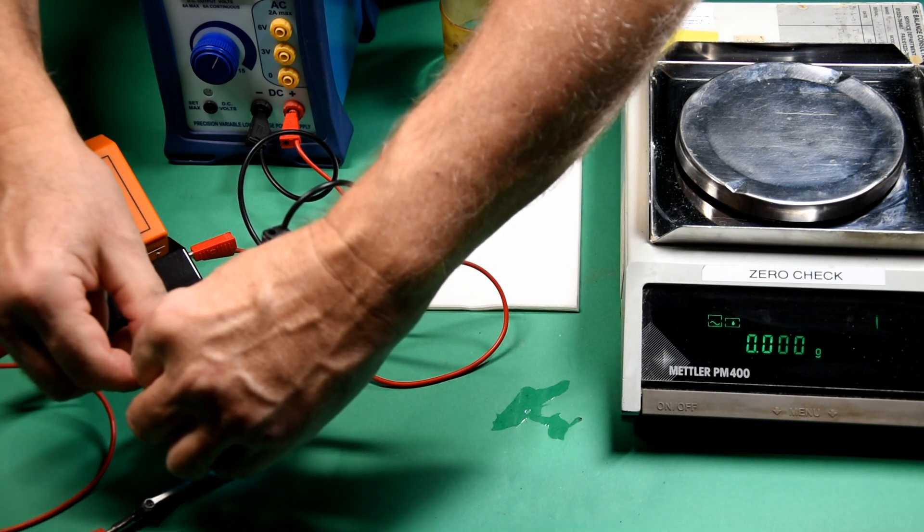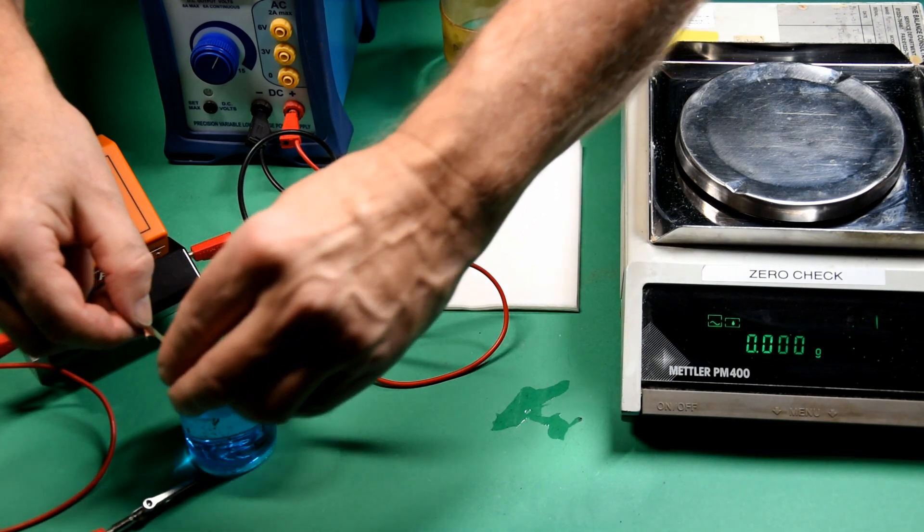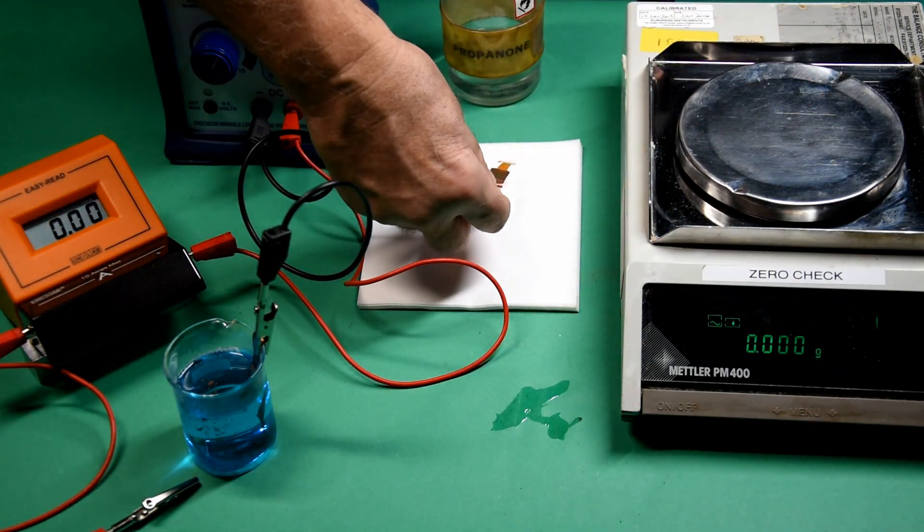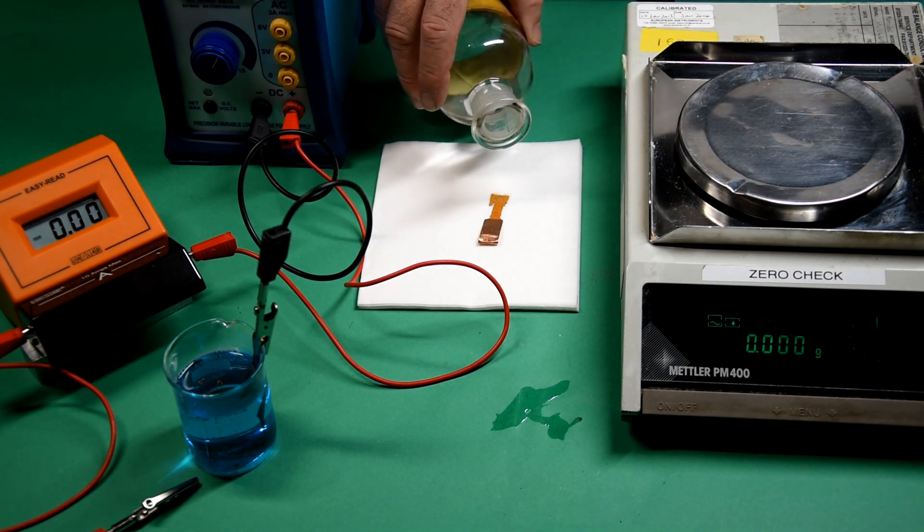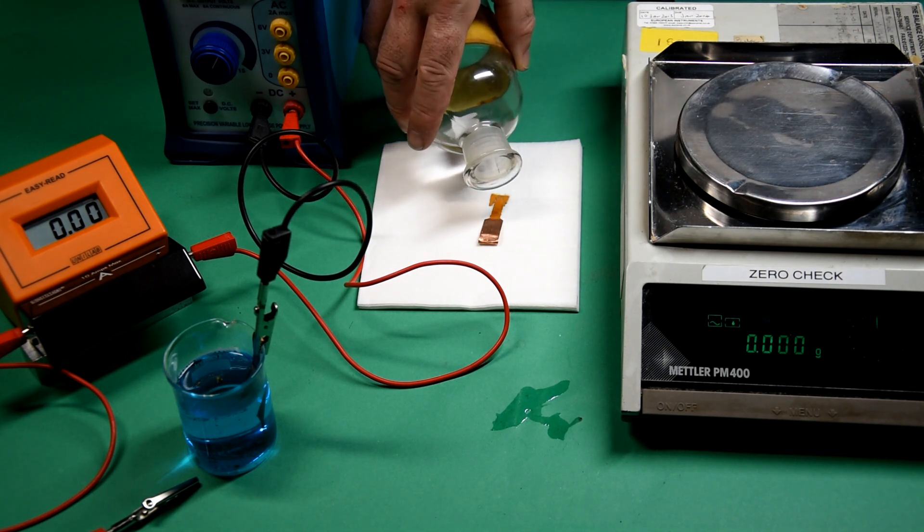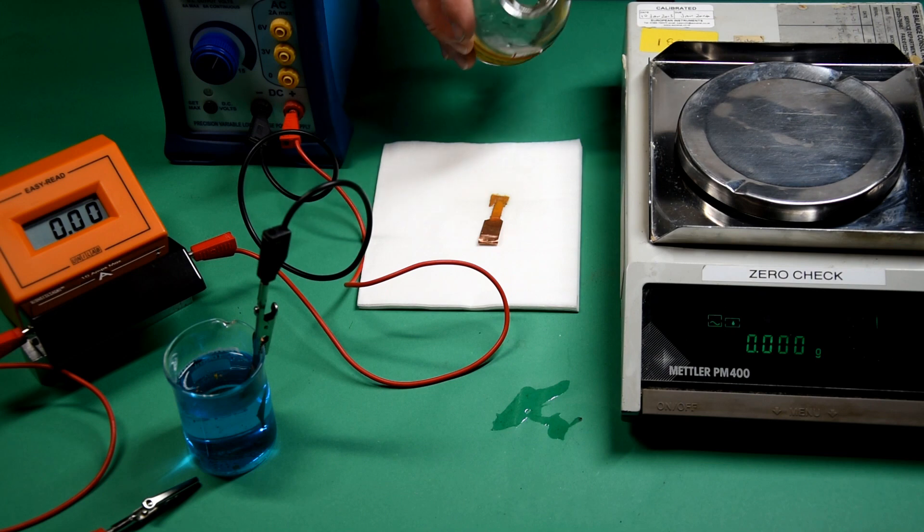Now we can remove the anode, but before we weigh it, we have to dry it, and I'm going to do that using propanone. I'll soak it with propanone and then leave it to evaporate, resulting in a dry electrode.